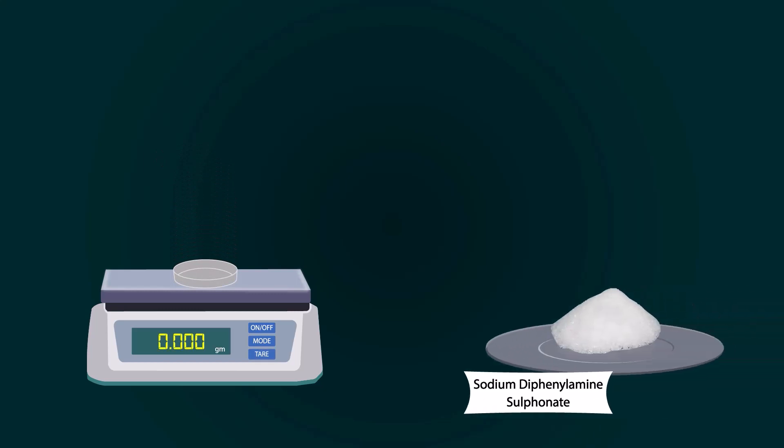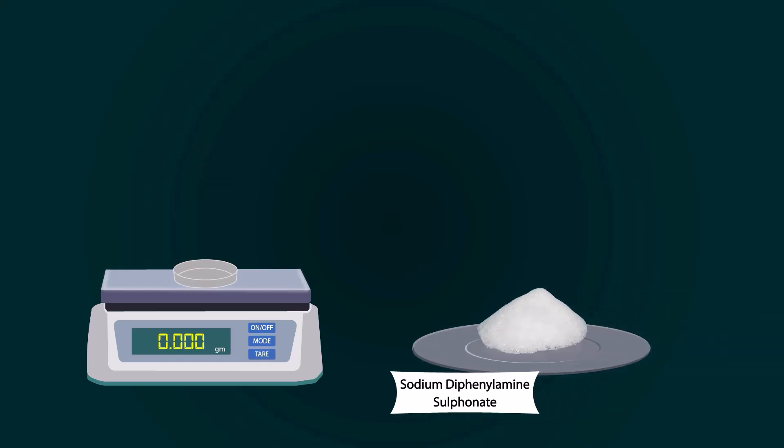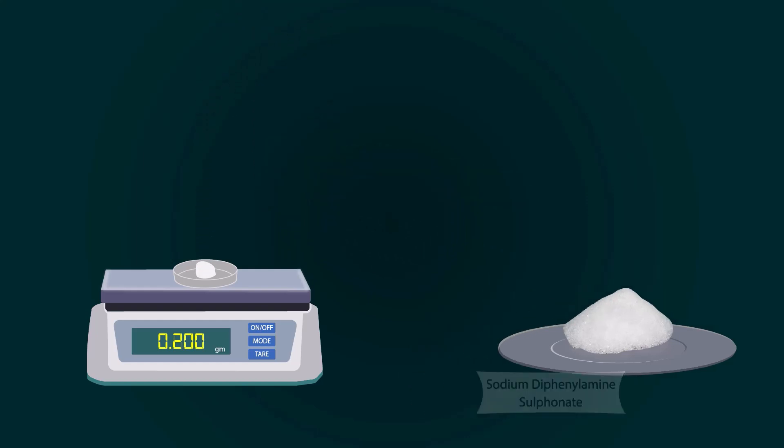Now take sodium diphenylamine sulfonate chemical from the stock bottle. You can put sodium diphenylamine sulfonate into the petri dish with the help of a spatula. Weigh precisely up to 0.2 grams.